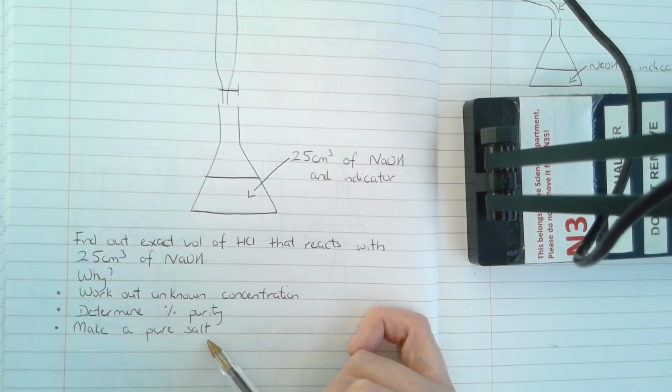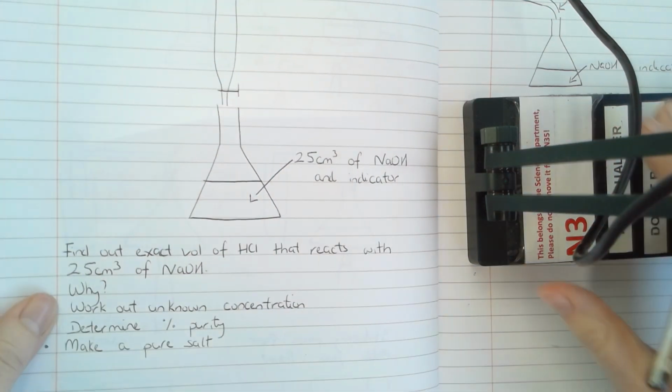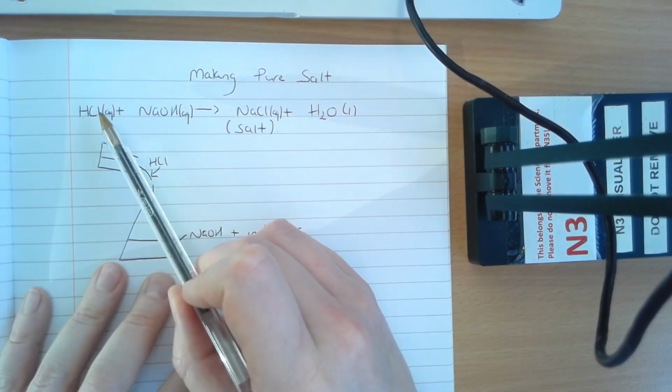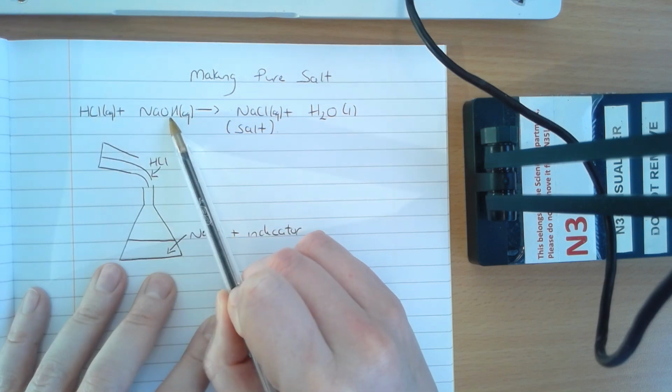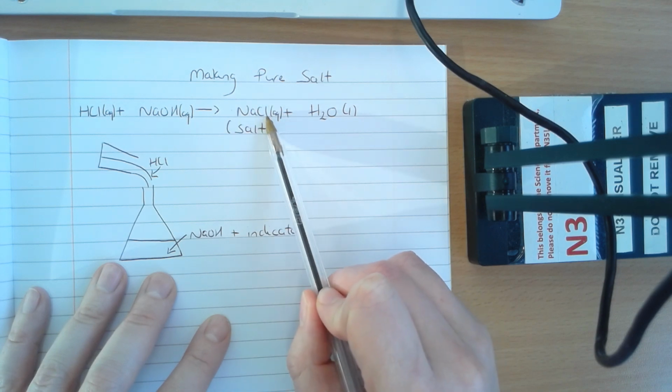And then the final, most basic application is you can just make a pure salt. And this is the first one that I'm going to focus on. How do we use a titration to make a pure salt? Okay, so I'll give you an example of an equation. If I want to make a salt, I'm going to react an acid and a base. So I've got an acid and a base reacting, and the salt I'm making is sodium chloride.